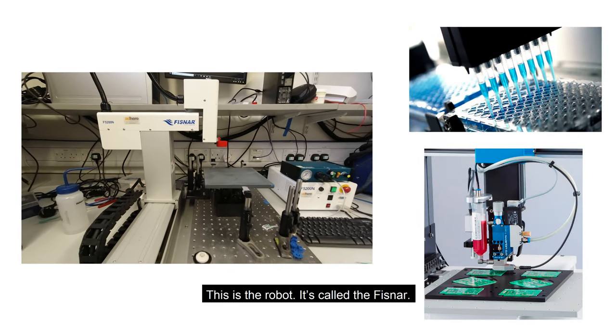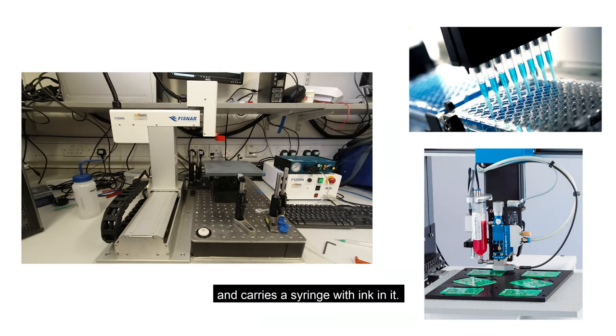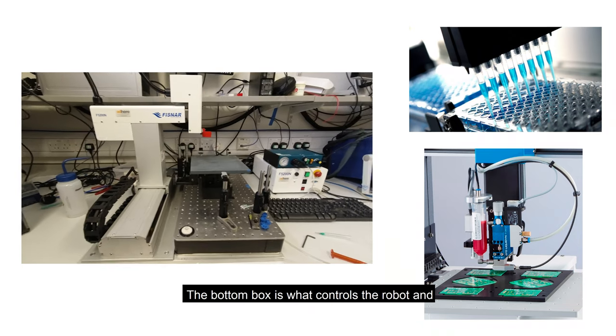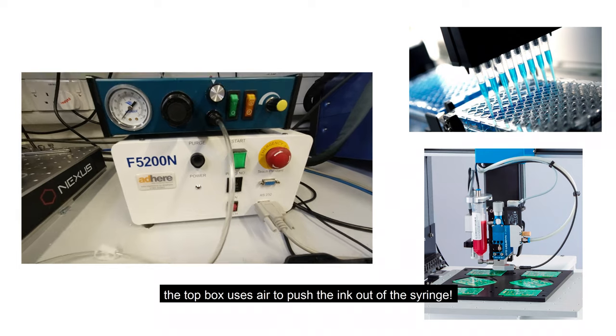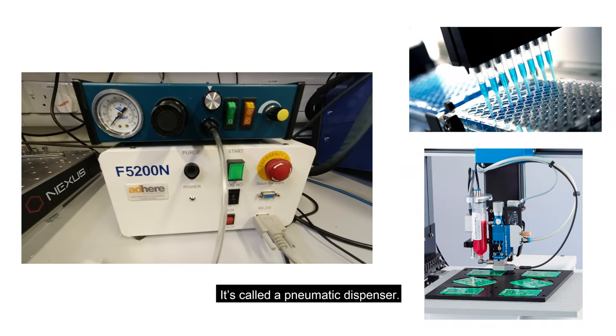This is the robot. It's called the FISNAR. It can move in three directions and it carries a syringe with ink in it. The bottom box is what controls the robot, and the top box uses air to push the ink out of the syringe. It's called a pneumatic dispenser.